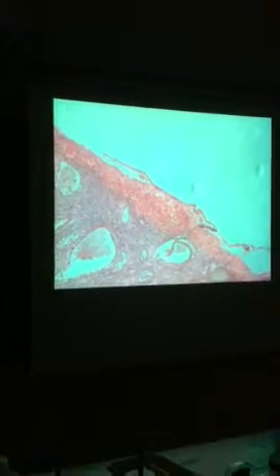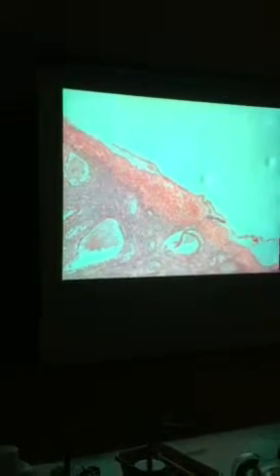Okay, what we're looking at up here, you can barely see it. It's horrible. Let me get a different one because that's really bad. Of course. All right, so here's the layer we're looking at.